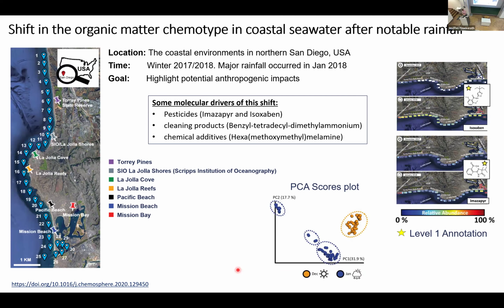So, talking briefly about the data set. The data set we are going to use is dissolved organic matter. Basically, what Daniel did to get a data set was sample seawater in a lot of different locations close to, I think it was La Jolla. Sorry, oh yeah, the San Diego coastline.